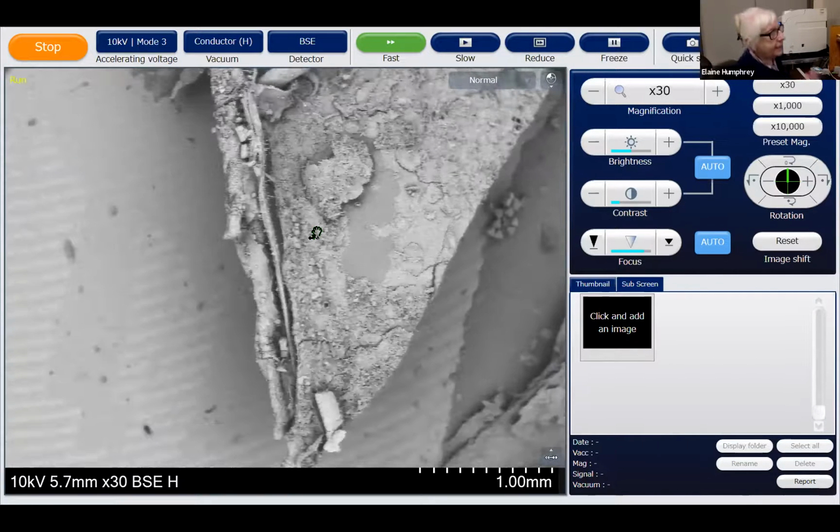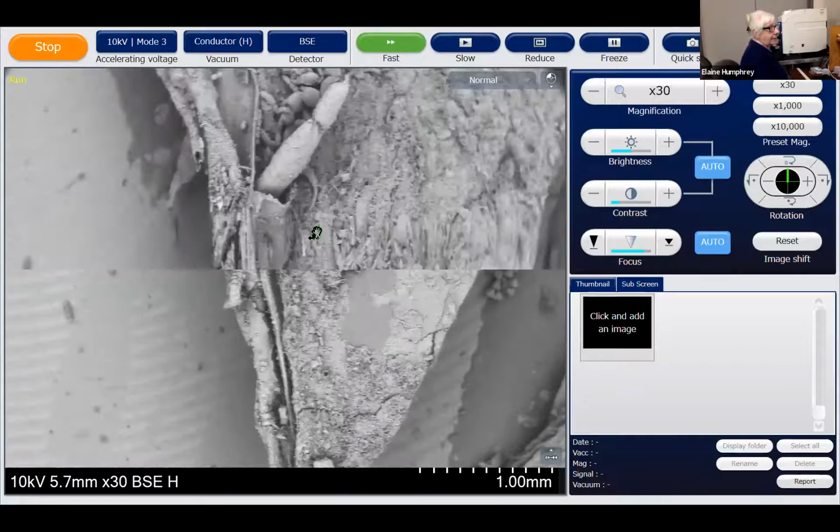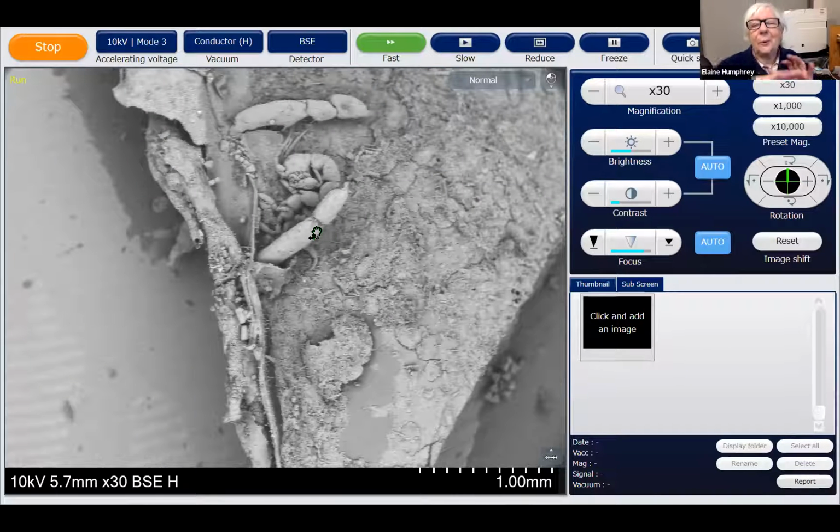And you can see that this is a grayscale image. There's no color in a scanning electron microscope. If you find an electron micrograph that's colored, it's been colored in afterwards. Falsely colored afterwards. And you have to think of a rainbow. If you think of a rainbow, what's happened is the white light's been split up into all its different wavelengths. So the red end are the long wavelengths. And if you look at a rainbow, it goes from red through to blue. And blue are the short wavelengths. And the shorter the wavelength, the higher the resolution.